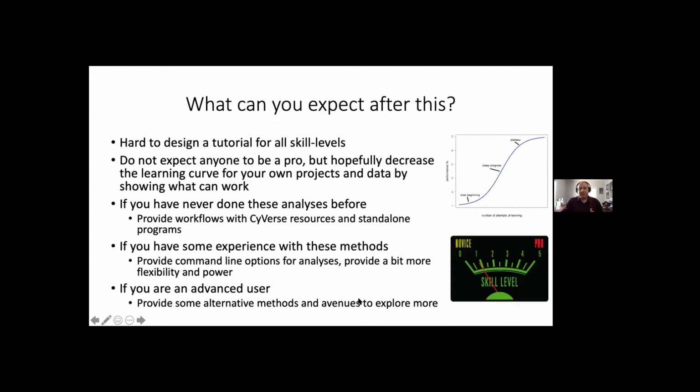So here's an example on the right. Maybe when you're first starting to figure these programs out, it takes a while to figure out what the inputs and outputs may be. I'm hoping that after this webinar, we can really increase your progress so that you are doing analyses both with this test data set and your own data set to start addressing questions that you're interested in. However, I have been able to break this down a little bit more about what you might expect with different levels that you are interested in.